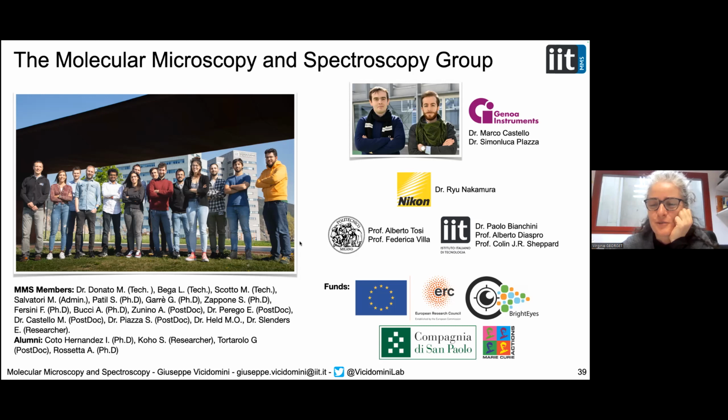Yeah, I have just a short question about the FLIM part. I presume that you need to have a pulsed laser source in this case, or am I wrong? No, it's true. What we do is implement a conventional time correlated single photon counting measurement. I may say conventional, not really, because when people think of time correlated single photon counting, they always think I'm losing photons. That's not really true. But anyway, you need a pulsed laser. You need to synchronize your excitation with your detection, and this is typically done with a pulsed laser. Yeah. Okay, thank you.